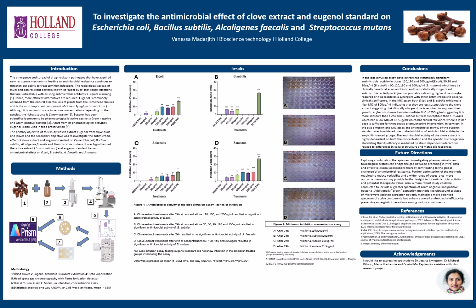Thus, antimicrobial activity of the clove extract is highly dependent on both the concentration and the specific microorganism, elucidating that its efficacy is mediated by strain-dependent interactions related to differences in cellular structure and metabolic responses. In contrast, in the disk diffusion and MIC assays, the antimicrobial activity of the eugenol standard was invalidated due to the inhibition of antimicrobial activity in the ampicillin-treated groups.